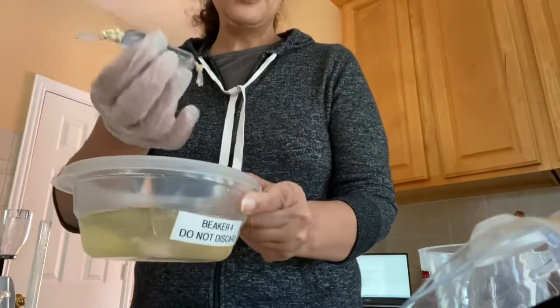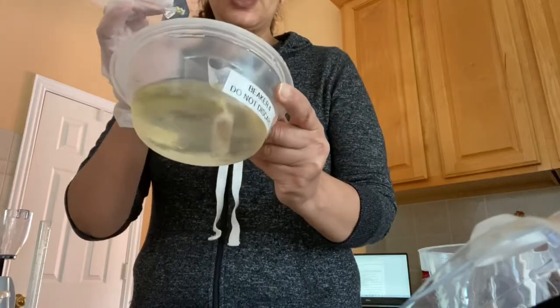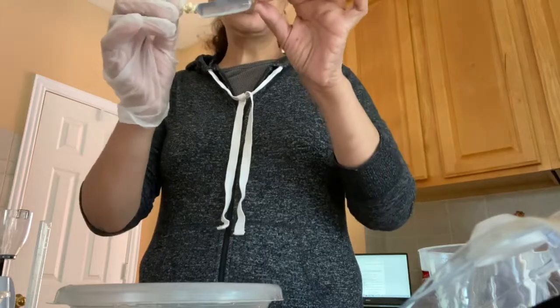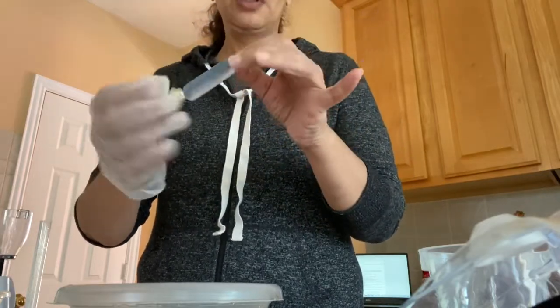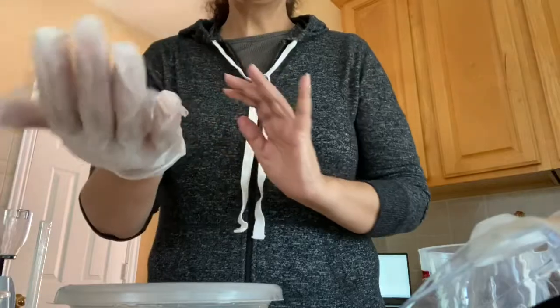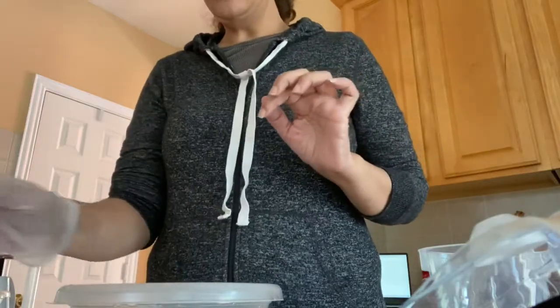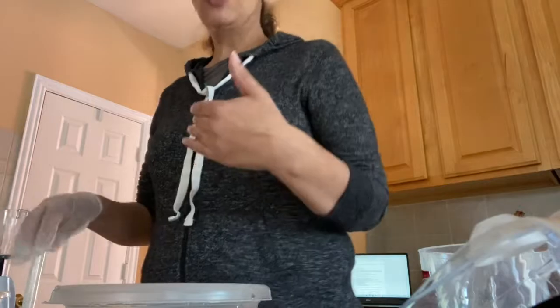All right. So you don't see any dark blue outside because this membrane does not let big molecules cross. Starch is a polysaccharide molecule. It doesn't go outside, but iodine will go inside, and you see it turn dark blue. That's it. We finish our artificial dialysis, diffusion through this membrane.